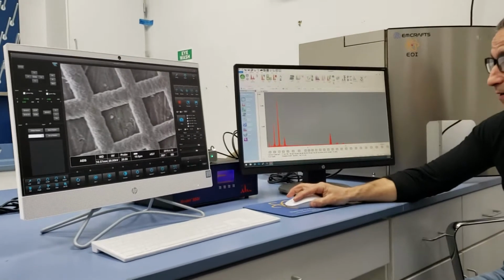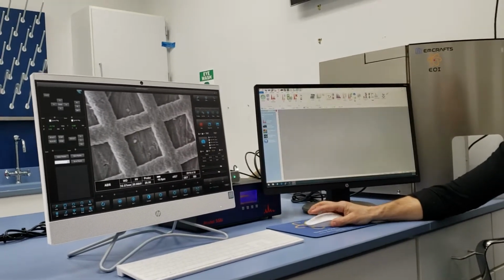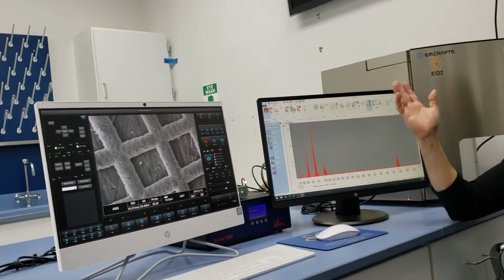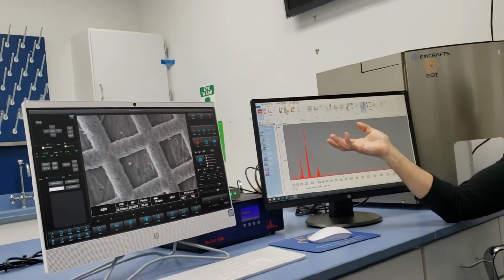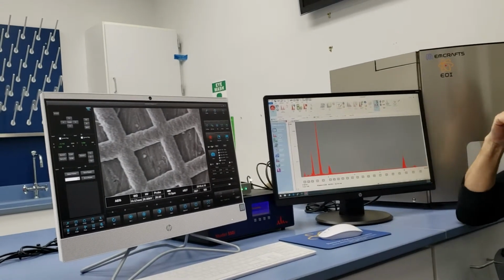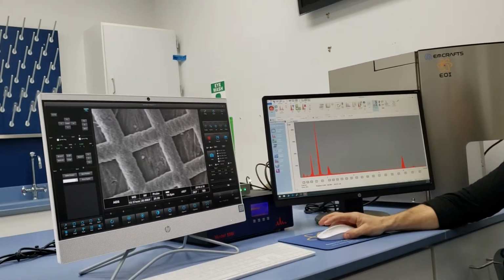All I did was what? All I did was go work with Spectra, and I wanted to acquire Spectra. That's all I've done, and it's acquiring Spectra. For how long again? 25 seconds, right? Unless I tell it to stop, which I'm going to stop. Okay?